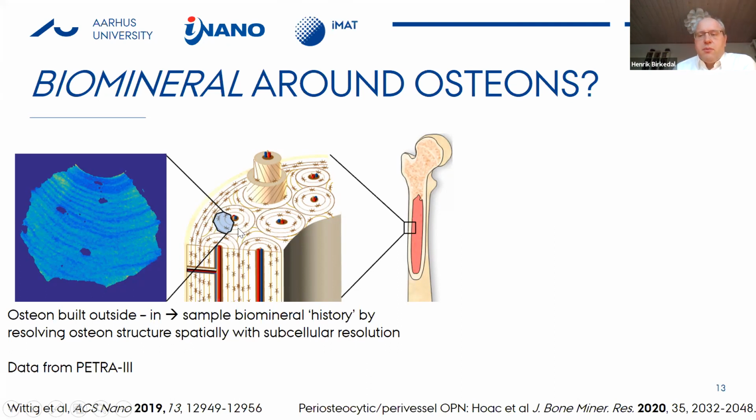So we can follow the biomineralization history by spatially resolving the mineralization profile across the osteon. That of course needs to be done with submicron resolution in 3D. And this particular experiment was done at PETRA, but of course the same can be done at the ESRF. This was done with a 400 nanometer X-ray beam.